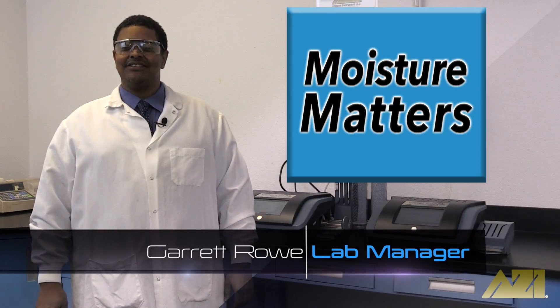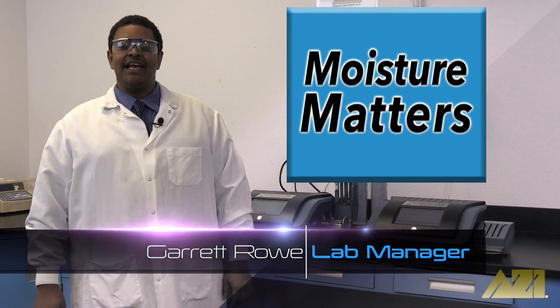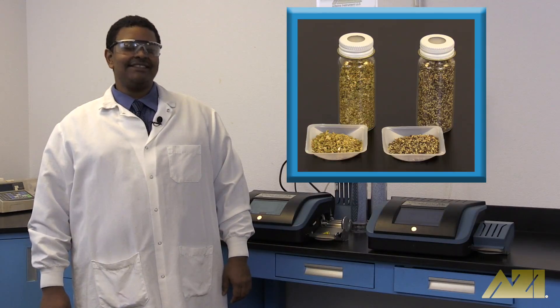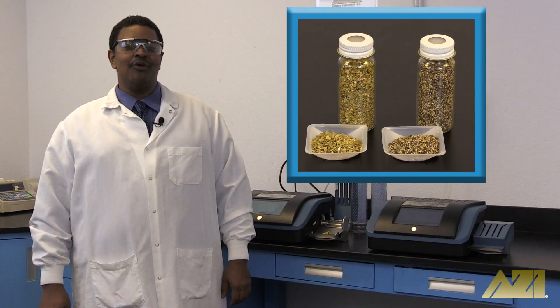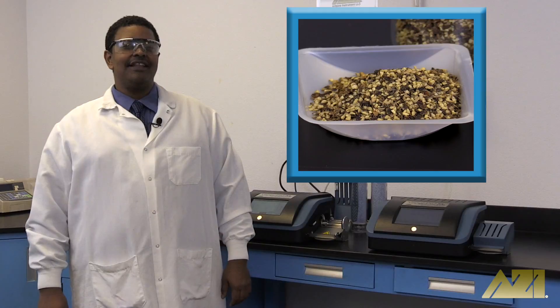Hello and welcome to Moisture Matters, the show where we take your everyday and not so everyday objects and test them to see which has more moisture. Today we're testing spices. Which do you think has more moisture, oregano or ground black pepper? Let's find out.